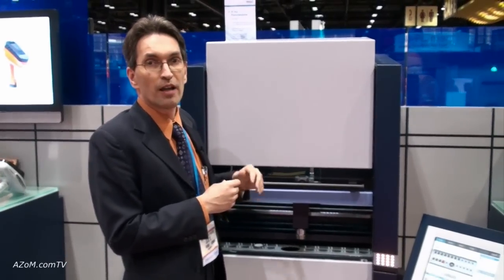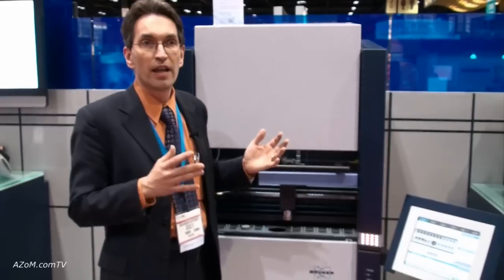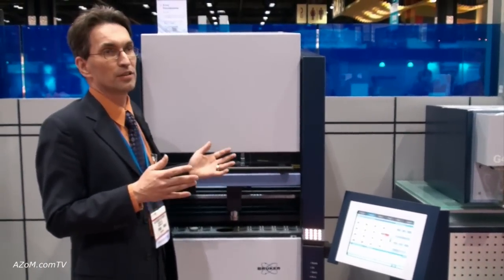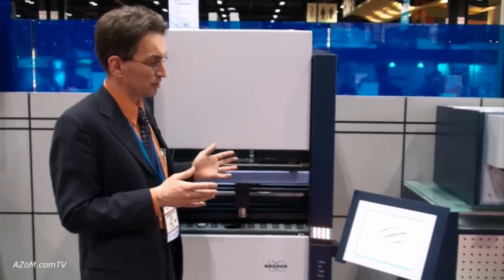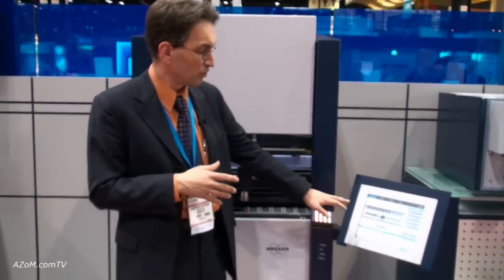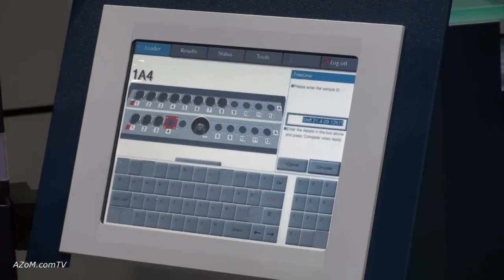A very novel concept is that there's no external computer attached. Normally you don't want computers in a dusty environment because they lead to more breakdown problems. So this unit is standalone and dedicated, enabling ease of use — just at the touch of a button — the same as our S8 Tiger series sequential units.